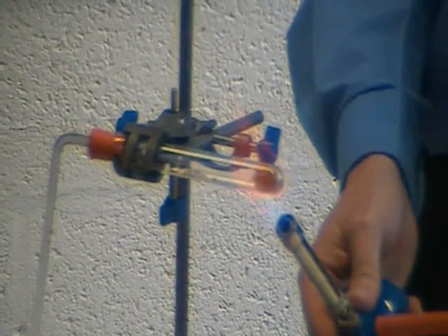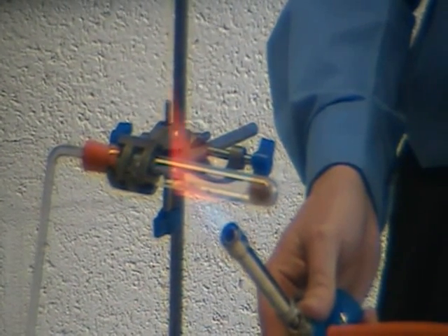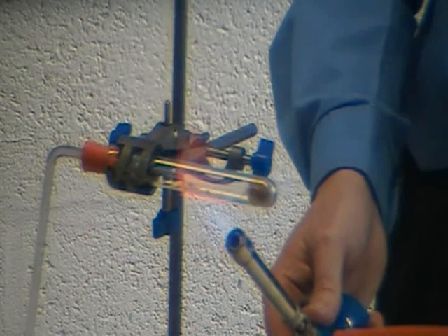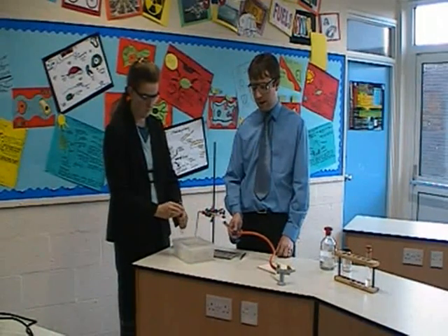The reaction is working quite nicely now. We've already collected half a boiling tube full of gas. This is the area where pupils will make an error if they're not careful. The important thing now is that we keep the heat on the test tube as we lift it out of the water.